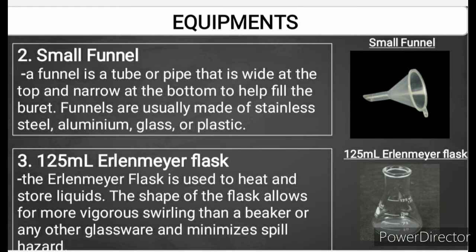Second equipment, small funnel. A funnel is a tube or pipe that is wide at the top and narrow at the bottom to help fill the burette. Funnels are usually made of stainless steel, aluminum, glass, or plastic.